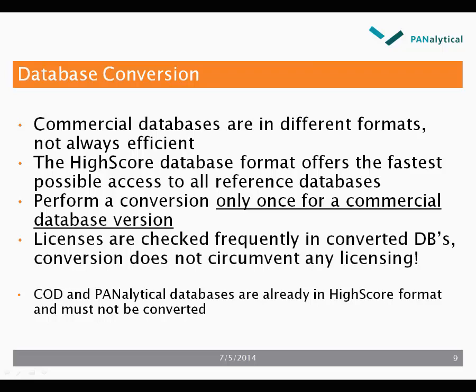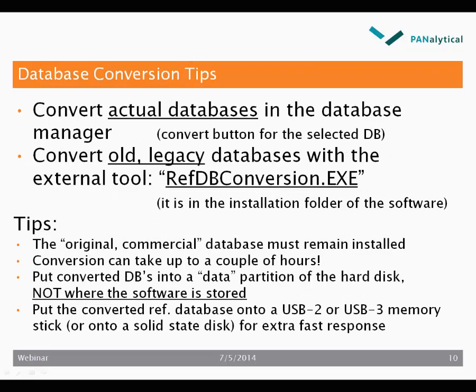The COD and the Panalytical databases are already in Highscore format and must not be converted. You convert the actual databases in the Database Manager with the Convert button for the selected database. Old legacy databases must be converted with the external tool RefDB Conversion Exe.